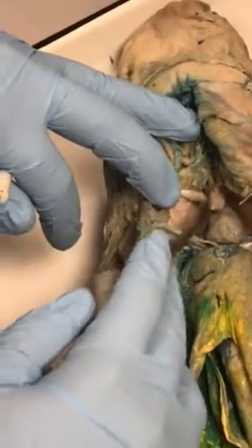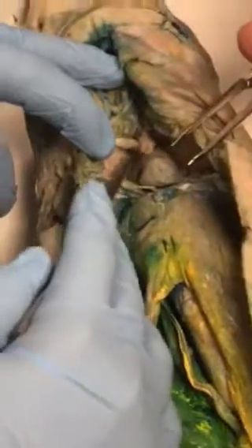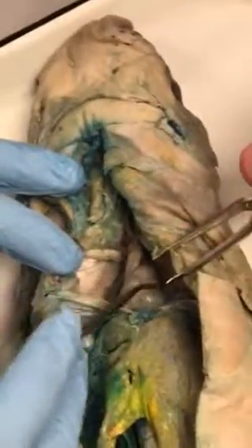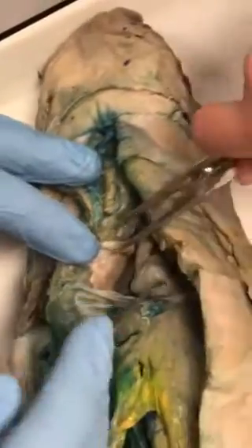Little white strip? Yep, that's coming up. Like the one in this exam, see, here's the big ventricle, and then here's this thing I'm poking right there. Okay. You can look through the camera if it's bigger. Point at it again, please. This guy right here. See, here's the ventricle, this darker gray, and then as it gets a little bit lighter, that's the conus.